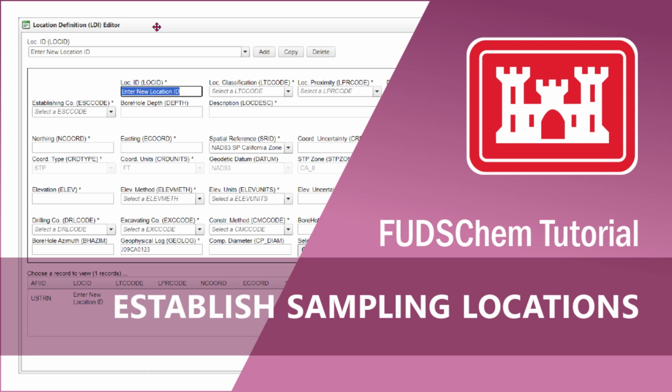Welcome, welcome! Connor the Contractor here to talk about getting sampling locations established in FUDSChem. The Corps really wants us to get these locations set up early so we're not scrambling later, so I'll see what I can do today here in FUDSChem.